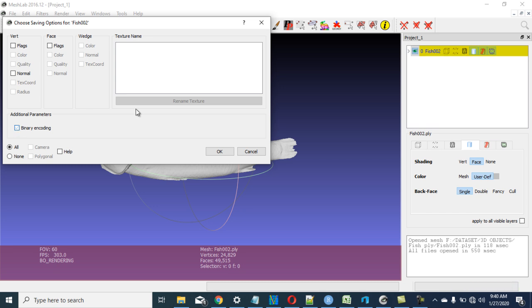Now I can uncheck this. If I don't want it in binary, I uncheck this. If I want it, I check it. So this is how you do it. So before you click on OK, you save. So this is very important. This binary option is very important because many of the applications require it to be binary, while many require it not to be binary. So some come with binary encoding, some do not.